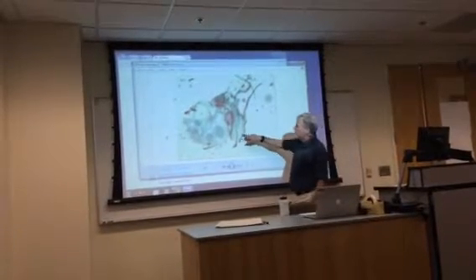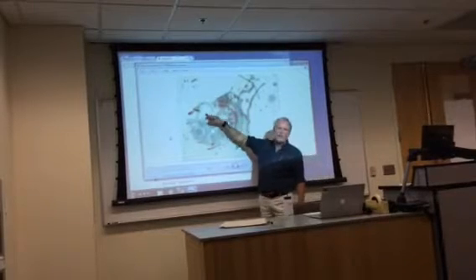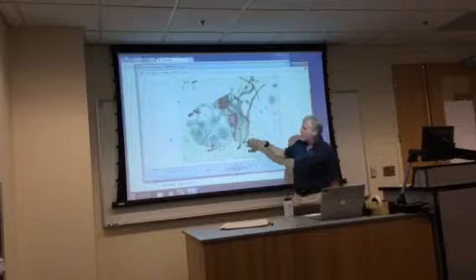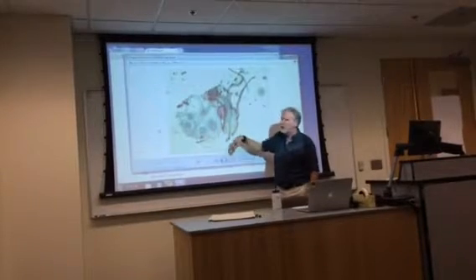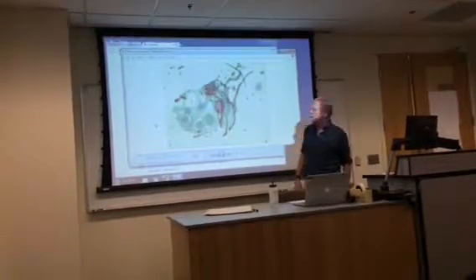Cross-section through these, so you're seeing these are the leaves. There's leaves that surround all of these structures in the leafy liverworts. And they're around the male, we call them androecium. They're just leaves that cover these antheridia, and it's called gynoecium if you're looking at the female with the archegonia.